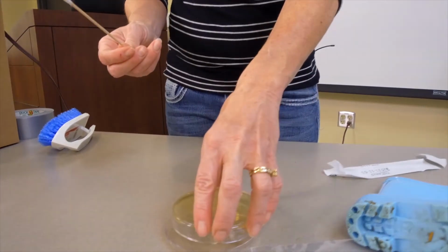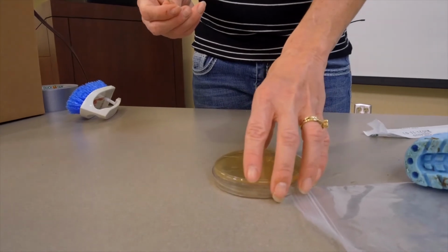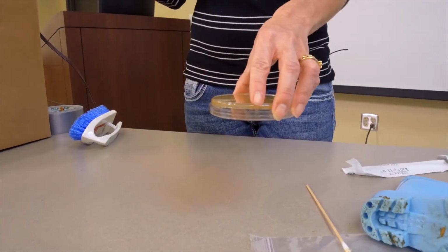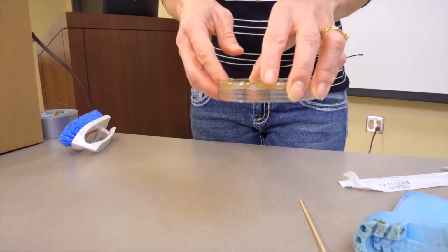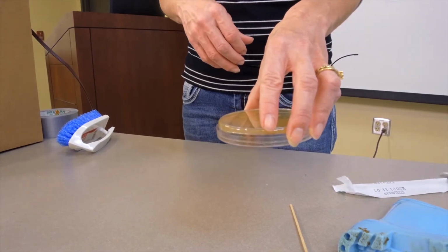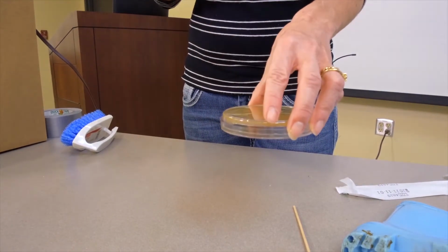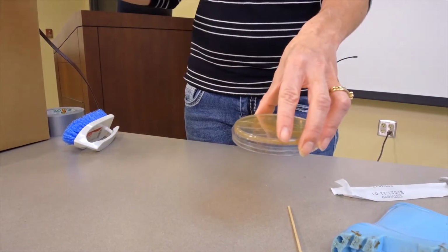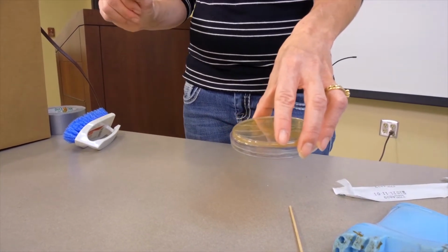Then I'm going to place it upside down, and that is to ensure that any condensation that forms when I put this in the incubator drops onto the top of the lid and doesn't hinder any of our bacterial growth. I'll label my plate so I know which one it is. In this case, this would represent my dirty boot before I place it into my incubator.